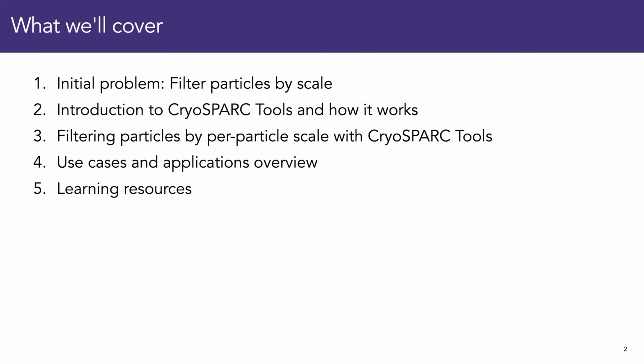Here's what we'll cover today. First, we'll take a look at an example problem that you might encounter while doing cryo-EM processing that doesn't have an obvious solution in CryoSPARC. I'll introduce you to CryoSPARC Tools and how it works. I'll show you how to solve that initial problem with tools. I'll give you a quick overview of some use cases that CryoSPARC Tools works really well for, and then I'll point you to some learning resources to help you get started.